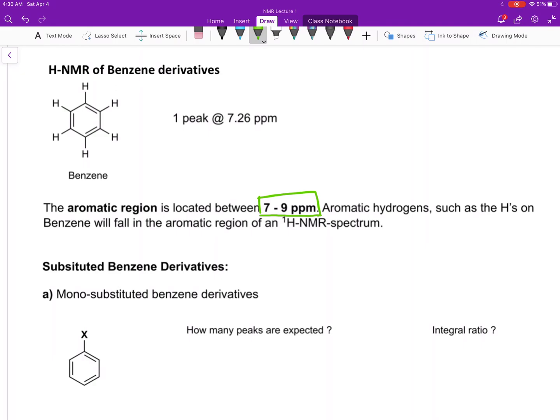The benzene ring by itself, without any substituents, you would expect to see one single peak, and that peak falls right at 7.26 parts per million. What happens when you remove one of those hydrogens and replace it with a different substituent? Let's look at substituted benzene derivatives.